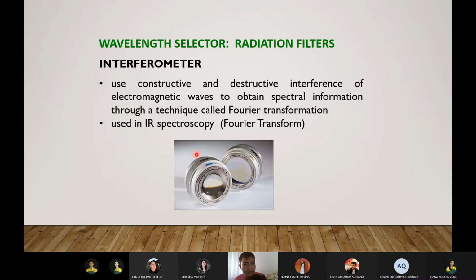So when you use IR spectrometers, it will scan the environment. Kailangan kapag nag-scan ka, nakatayo ka lang doon steady, kasi i-scan niya yung buong paligid ng kwarto. Tas sobrang lamig pa nun, to minimize the infrared rays. Kaya pag nag-scan ka sa isang room, mga 5 minutes yan siguro. Nakatayo ka lang, lalamigin ka na lang kasi super lamig dapat ng room. Tapos after doing that, then you can start analyzing na. Babasahin niya kasi yung infrared rays sa paligid to remove that from the measurement.